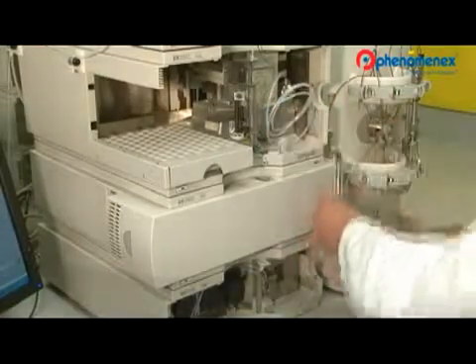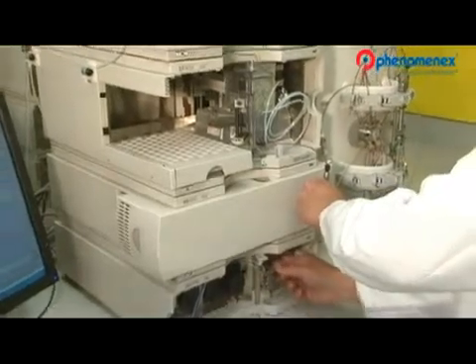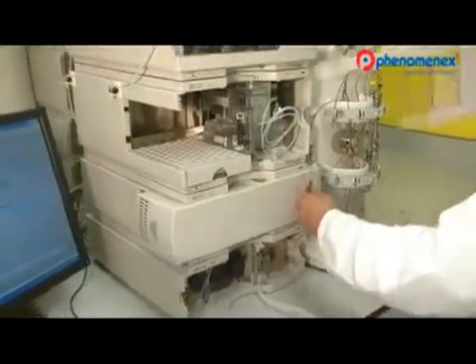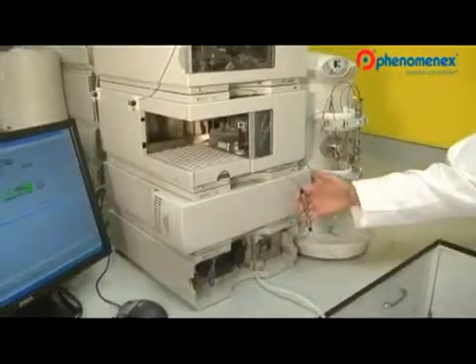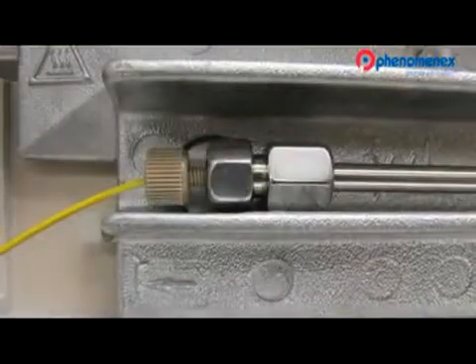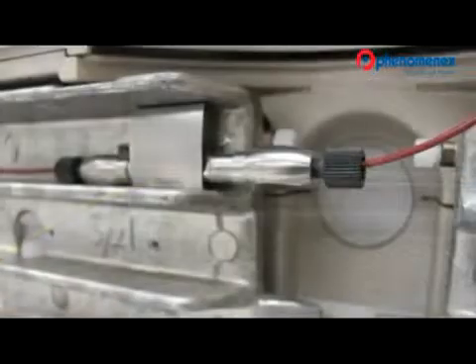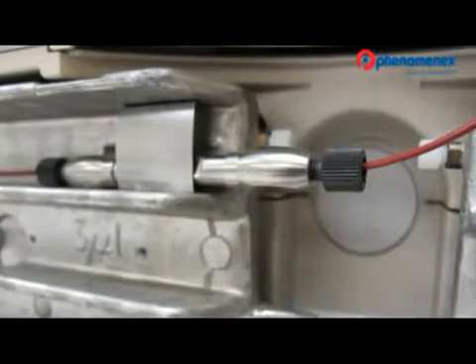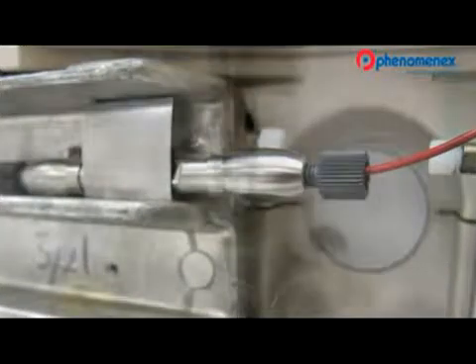Now I'm going to reconnect the column to the autosampler, bypass the heater, connect to the detector, and replace the autosampler door. If your method requires temperature control, bypassing the heater is not required. Using the red tubing while having your column in the open compartment will also provide you with noticeably improved results.